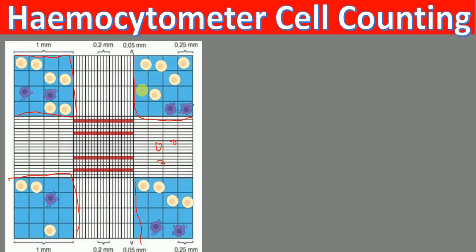Let's count how many cells are live and how many cells are dead within this square. Let's first count live cells: 1, 2, 3, 4, 5, 6 in this square, 7, 8, 9, 10, 11, 12, 13, 14, 15, 16, 17, and 18. So the number of live cells counted are 18.